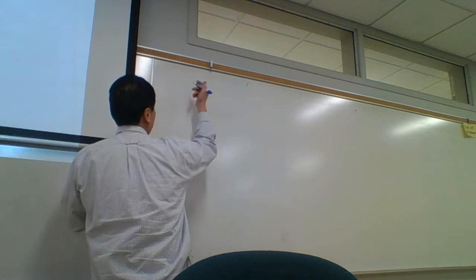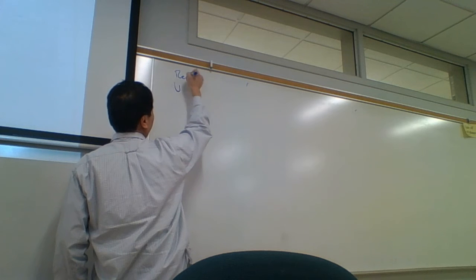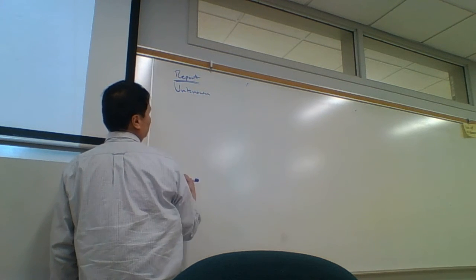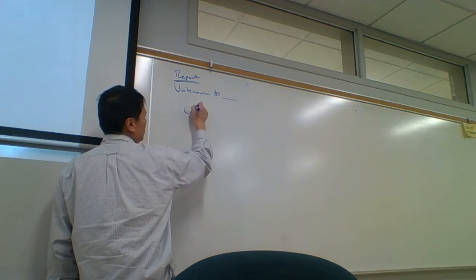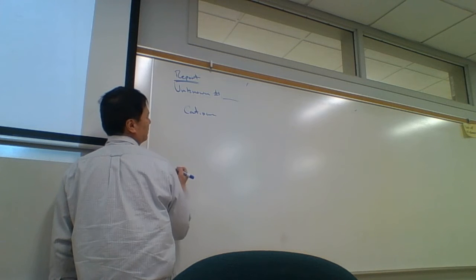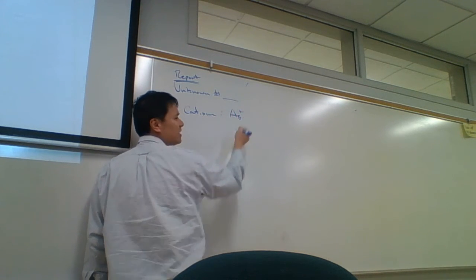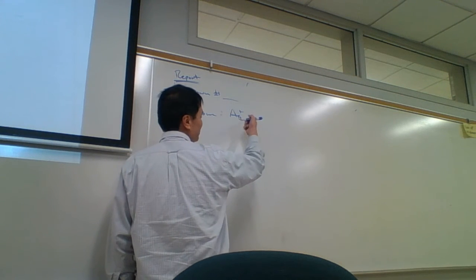The first one is the unknown. For the report, we just need the unknown number, and I just want to know what cations you found. So say, for example, I found silver, so I'm going to write silver ions. If there was no silver, then write whatever you found.